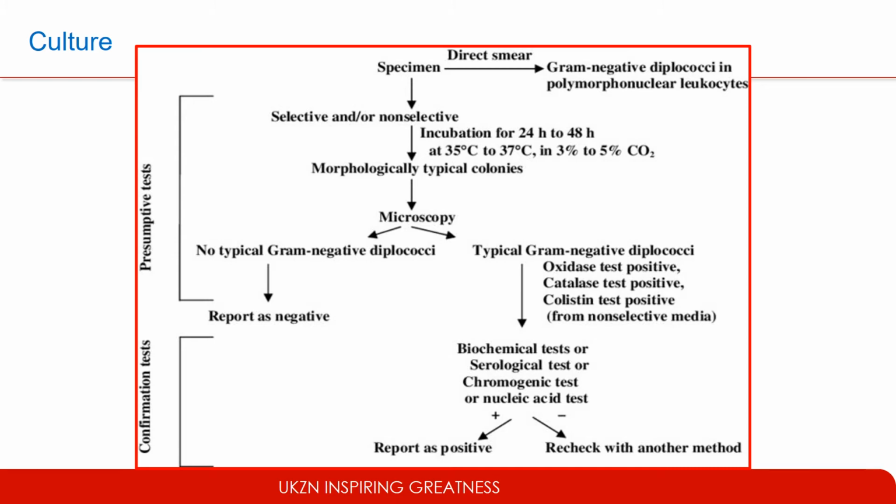The swab would then be plated onto selective media and incubated for 24 to 48 hours. Let's look at 48 hours being the optimum for the growth of any pathogens on the plate. After 48 hours, a few presumptive tests will need to be done, or confirmatory tests, including microscopy and biochemical analysis. At this stage, there is still no further confirmation.